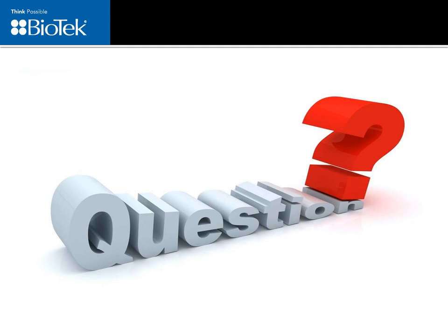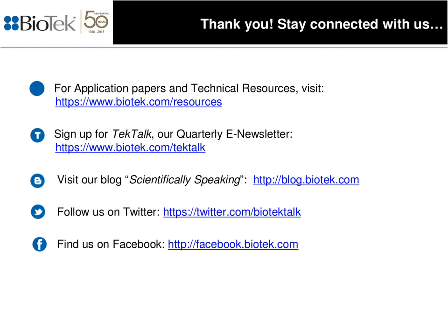And essentially what I showed there was a range of concentrations, and then we can use those PicoGreen RFU plots versus concentration as a standard curve to back calculate our sample concentrations, and this allows us to extend that range.